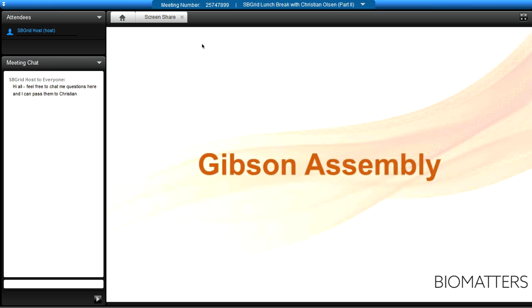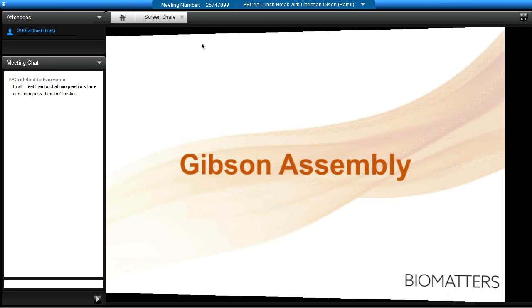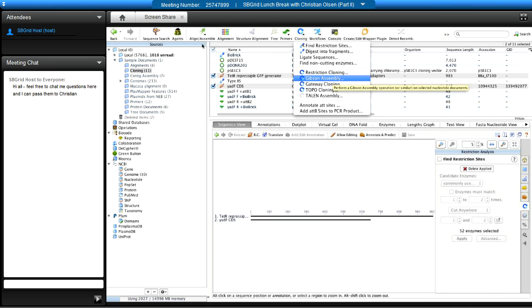Gibson assembly was added in version 7 after the community ranked it highly. Keep an eye out for CRISPR coming next week, and Gateway cloning is also in development. Gibson assembly is placed under the Cloning menu along with all other cloning options. To perform Gibson, select the pieces you'd like to ligate together and pull down to Gibson.